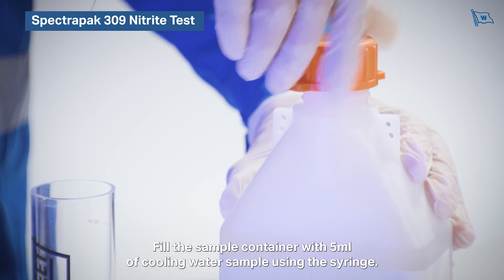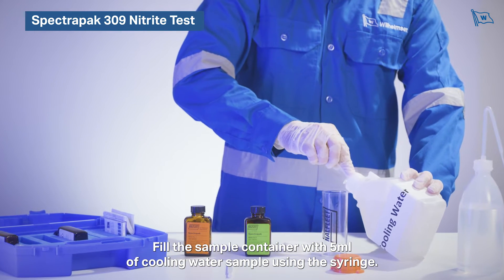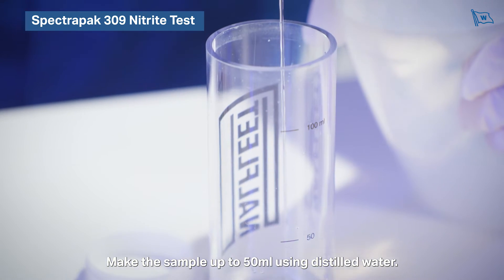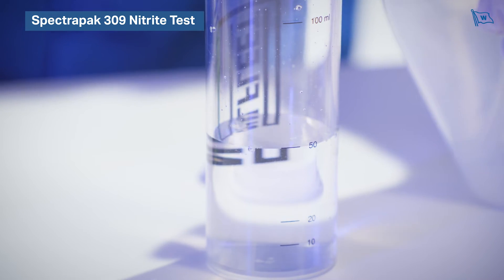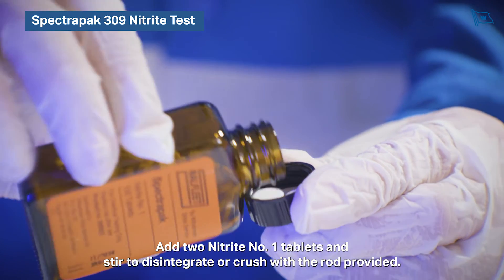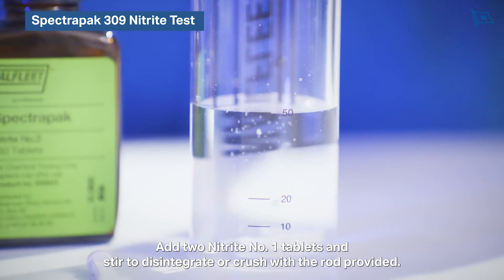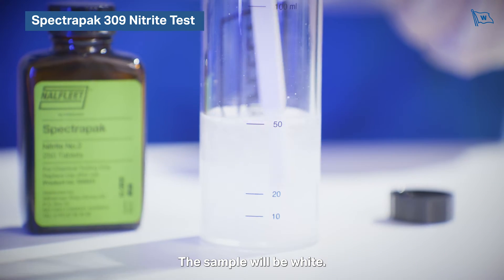Fill the sample container with 5 millilitres of cooling water sample using the syringe. Make the sample up to 50 millilitres using distilled water. Add two nitrite number one tablets and stir to disintegrate, or crush with the rod provided. The sample will be white.